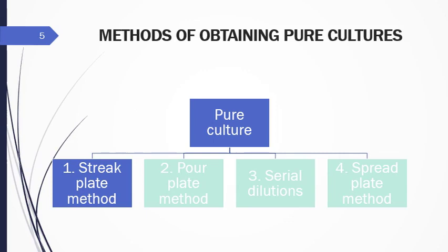To study bacteria in the lab, it is important to obtain a pure culture. Earlier, before the development of pure culture techniques, scientists studied mixed cultures, or cultures containing several different kinds of organisms. Researchers could make observations of different shapes and sizes of organisms, but they could find out little about the nutritional needs or growth characteristics of individual species.